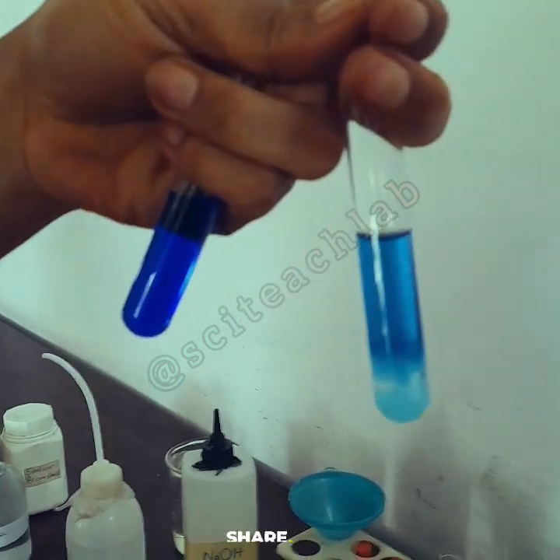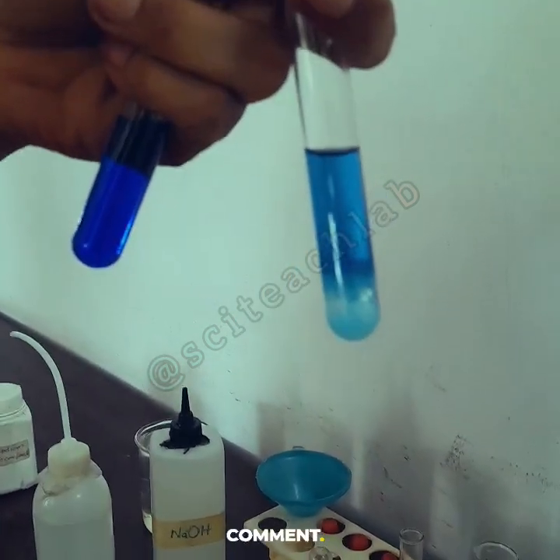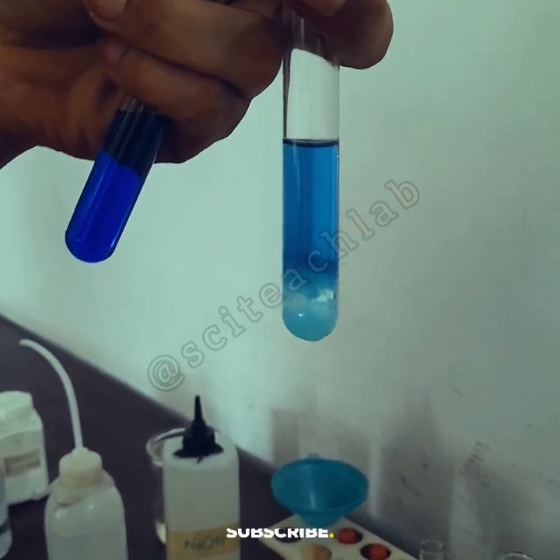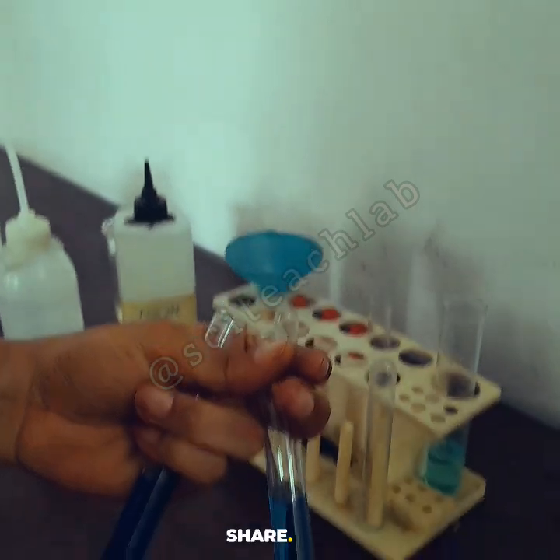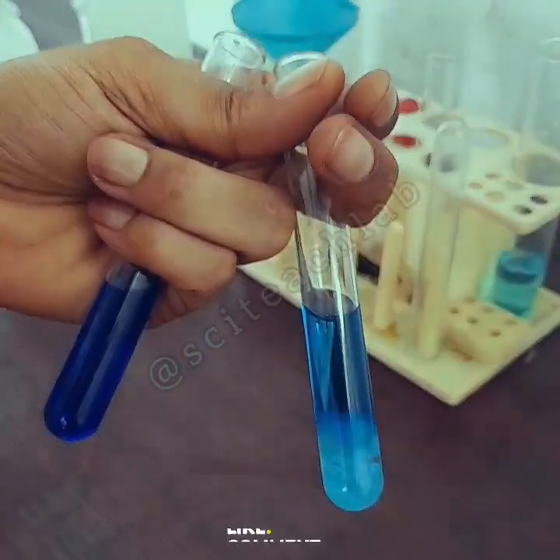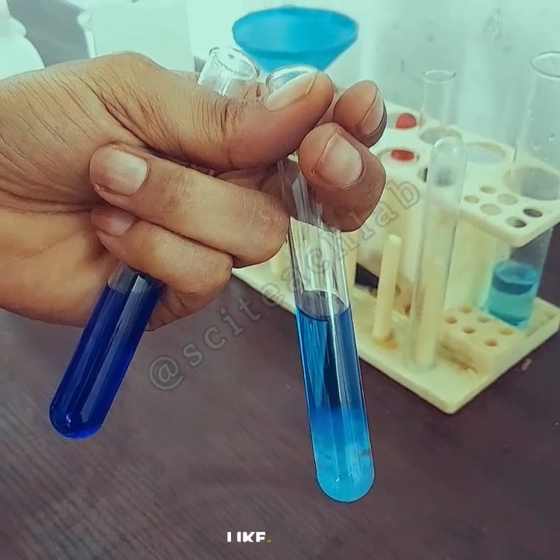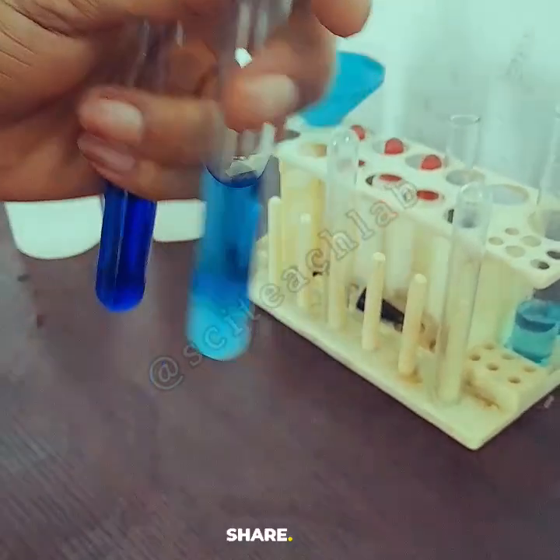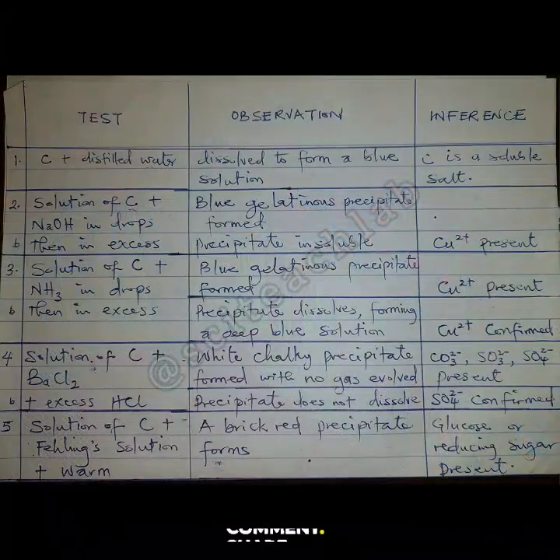That's a confirmatory test. That confirms to you that the ion present here is the copper Cu2+ ion. So you can see the difference between the one produced by sodium hydroxide and the one produced by ammonia. The one from ammonia is darker, it's a deep blue. So report deep blue when it's ammonia. Don't say not deep blue, just say blue precipitate when you're reporting for using sodium hydroxide.